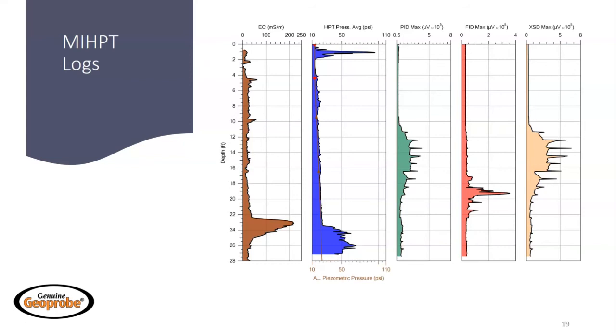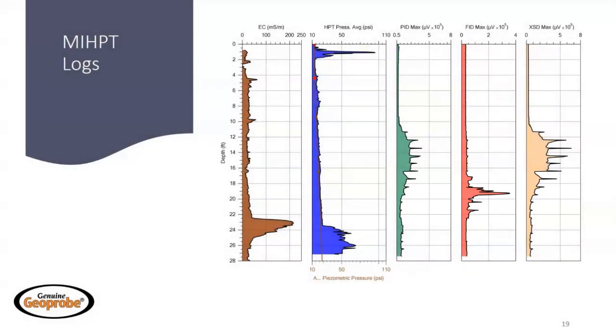Since we also see significant response on the FID, which is not mirrored on the PID because it's too high of an ionization potential, or the XSD, so it's non-halogenated, it's likely due to the presence of methane.